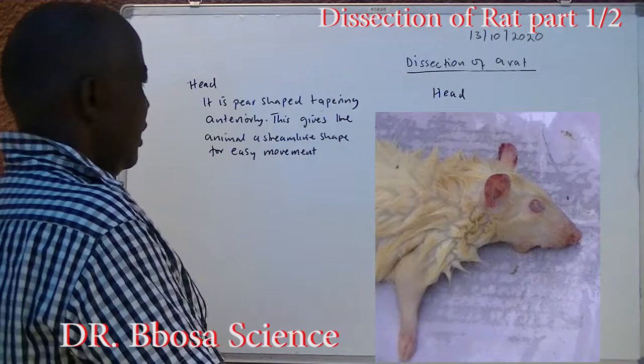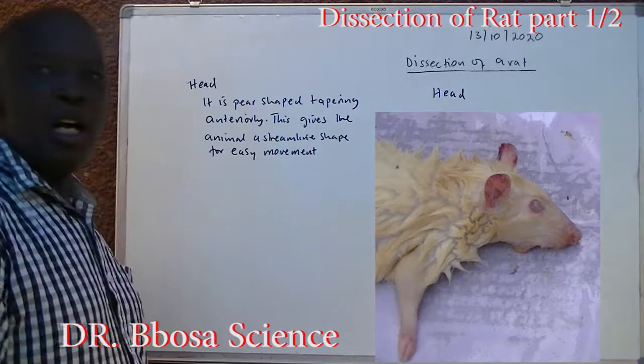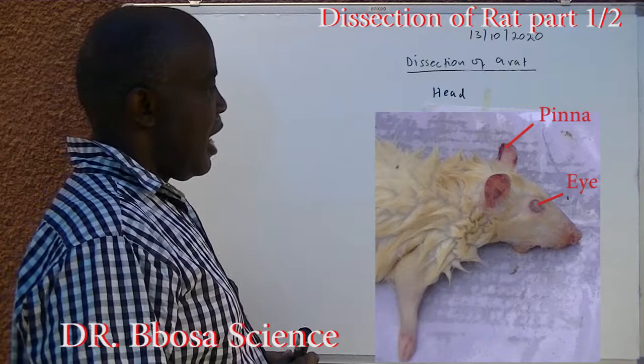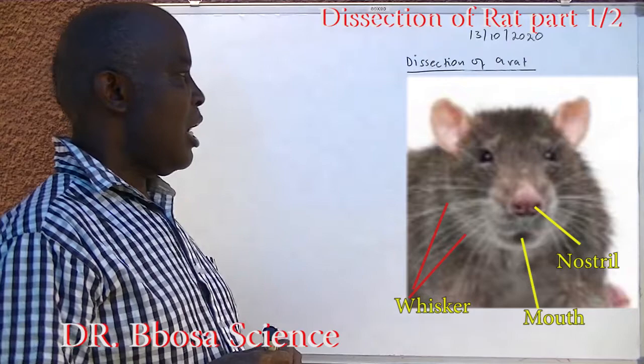The head is pointed and tapering anteriorly. This gives the animal a streamlined shape for easy movement. External features on the head include the pinna, eye, whisker, nostril and mouth.